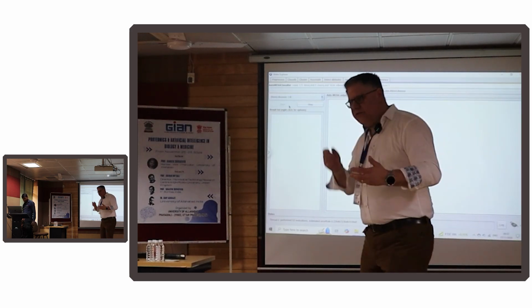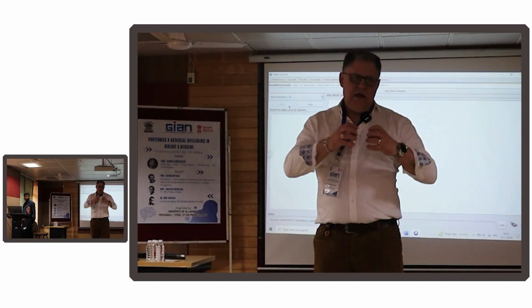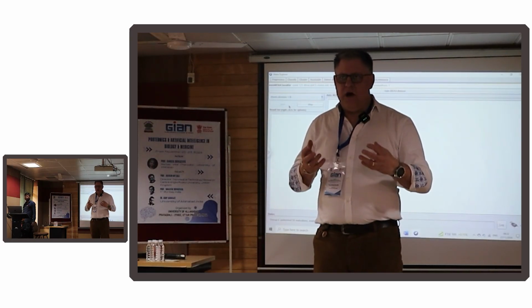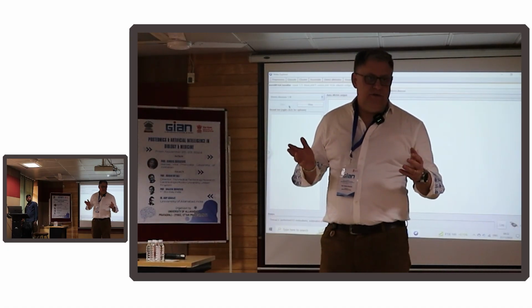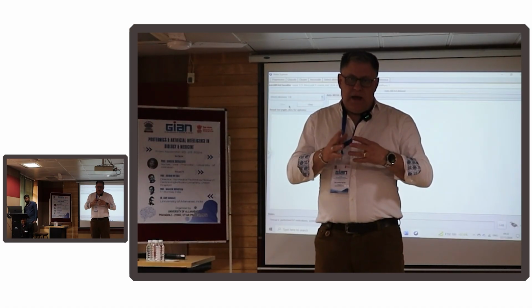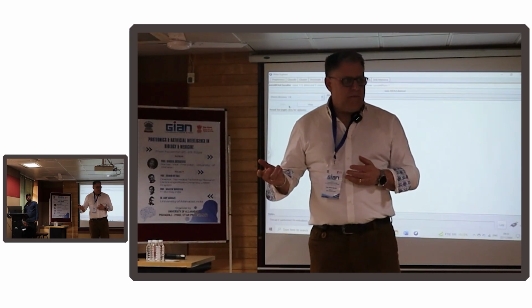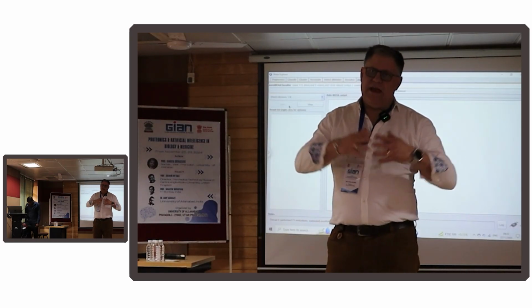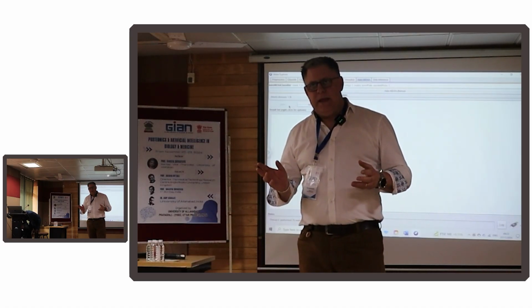I can't really show you how to do it because I'm doing it on the machine now. I don't want to change it, but you can tweak the settings of Java. It's not done in Weka, to increase the memory limit of Weka as well. I think it currently uses 16 gigabytes of memory, but you can change that to, if you've got a really powerful machine, 64 gigabytes of memory.